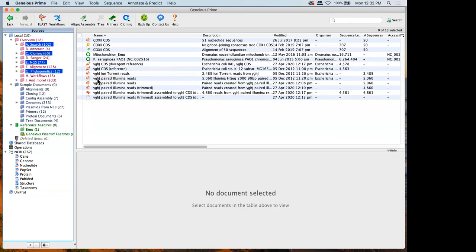I can see there's another question that's come through. Yes, Geneious is local desktop software. For more heavy operations, there's the Tufts cluster, and I might let Rebecca speak to that a little bit. What I can say is it is desktop software. You can run it on anything, but it is going to need a graphical user interface available. Like I said, you can import BAM files and that sort of thing. So you can potentially run your analyses using something else on a server and import the results in. But Rebecca might be able to answer that more.